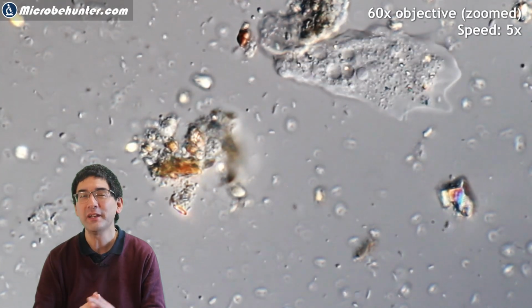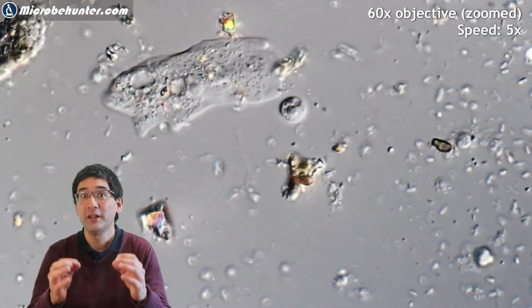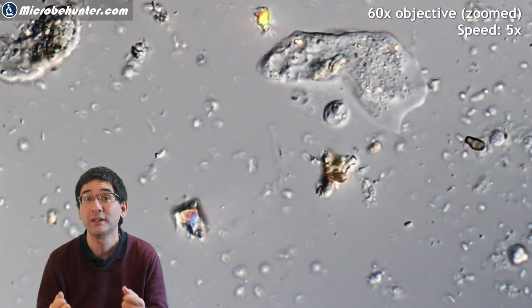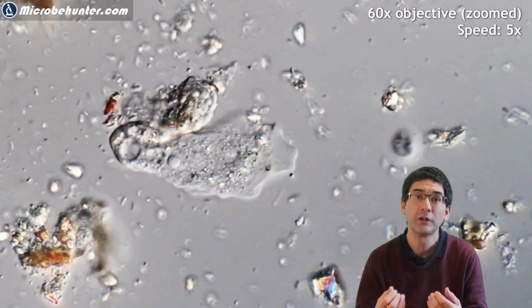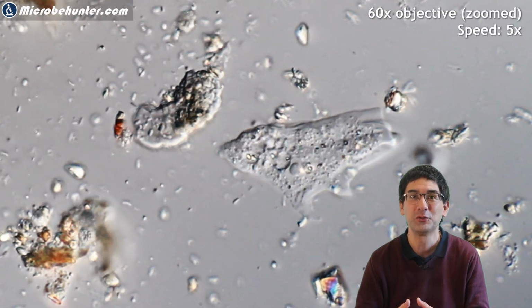I need to give you a small warning though. Amoeba are not the easiest microorganisms to observe. They are relatively small. It's also like this that many of them actually are transparent and they move quite slowly, so it's quite easy to overlook them under the microscope. But I hope that with this tutorial today I'm able to still make it possible for you to see them.